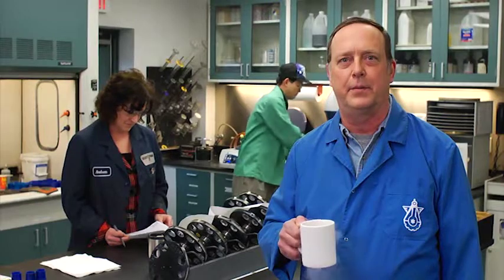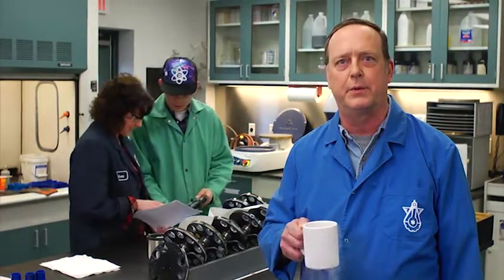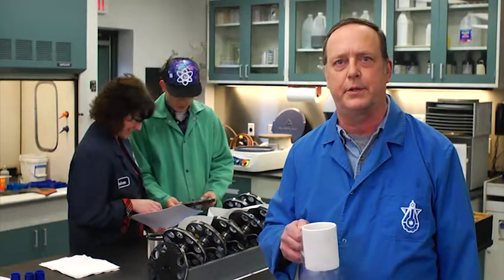I'm Gabe. I'll be your guide to one of the most modern and technologically advanced labs in the industry. This is where we do our mechanical testing and metallurgical analysis to ensure our product meets your specification.